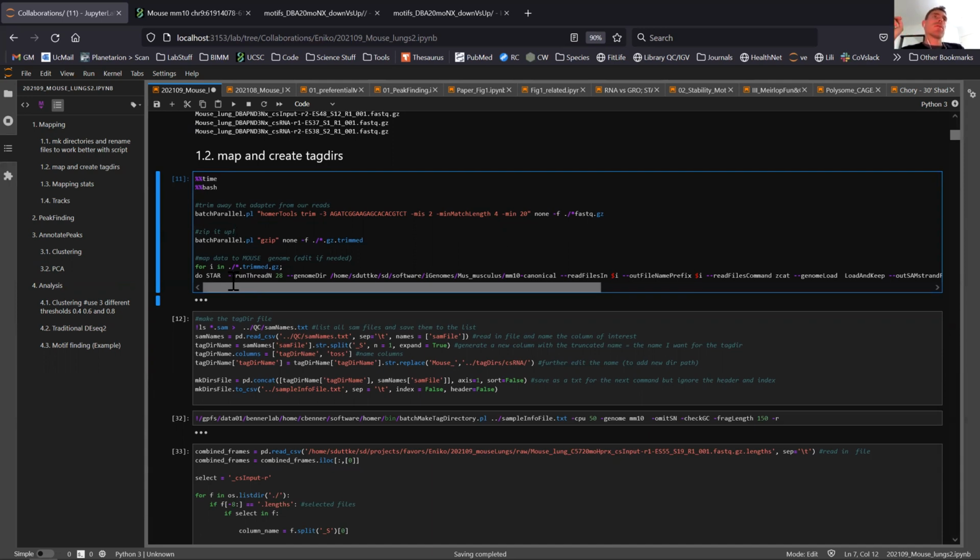The reason though I use STAR in this analysis is because, to the best of my knowledge, we will also generate RNA-seq data for this project. And if you have RNA-seq data, you will need to use STAR. I'm personally not a fan of combining directories or data that were mapped with different alignment tools. So you basically cater to the lowest common denominator, in this case RNA-seq.